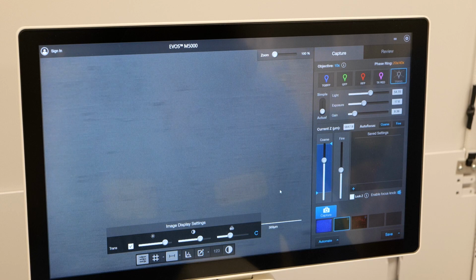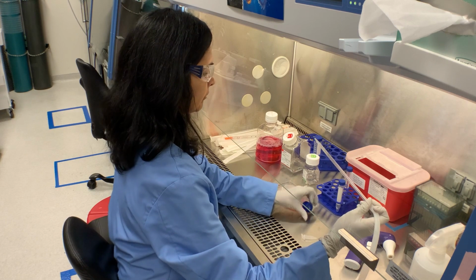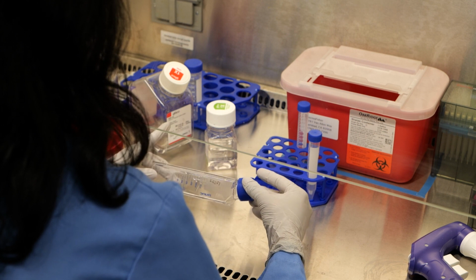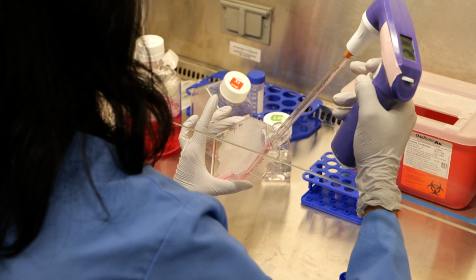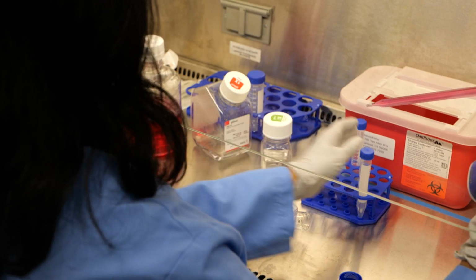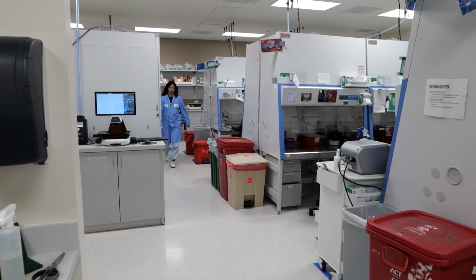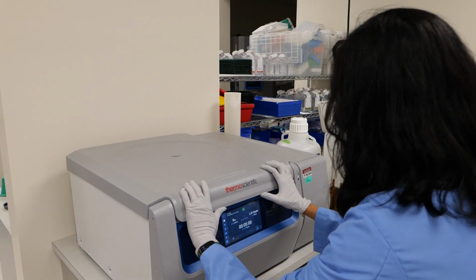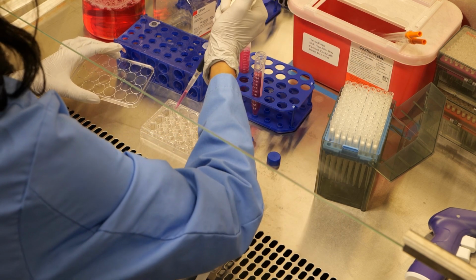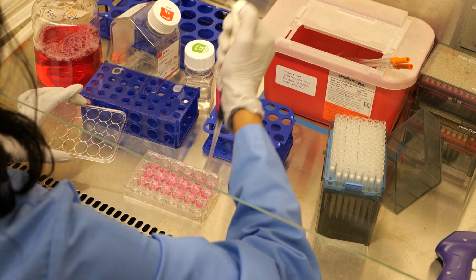To start your gene tagging experiment, cells must be properly cultured, counted, and seeded to ensure a consistent and healthy cell population is ready for transfection. Plate your cells so they are approximately 30 to 70% confluent on the day of transfection, with 3 replicate wells for each control and gRNA to ensure enough cells for downstream analysis.